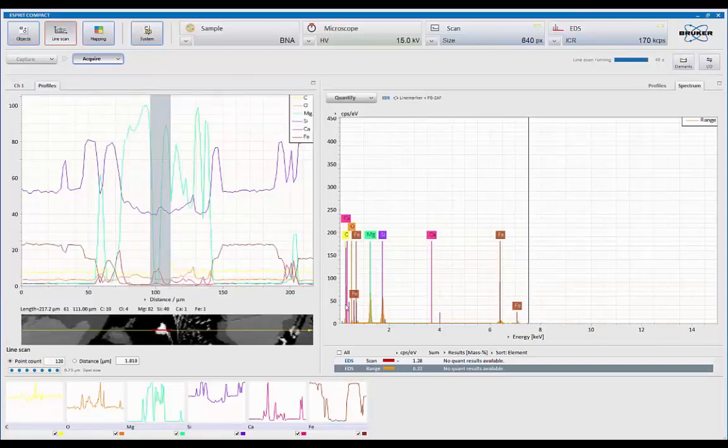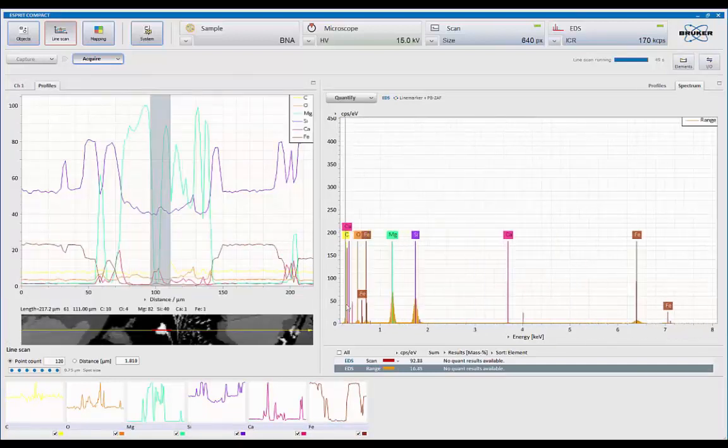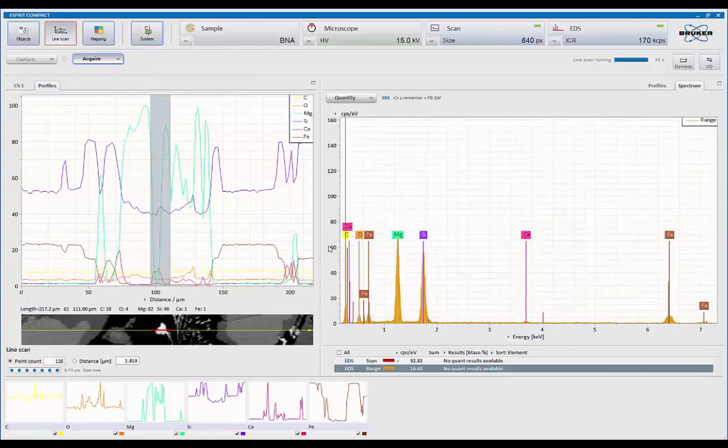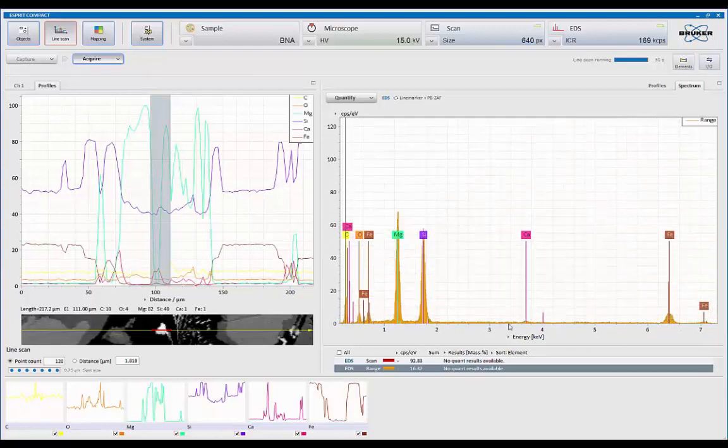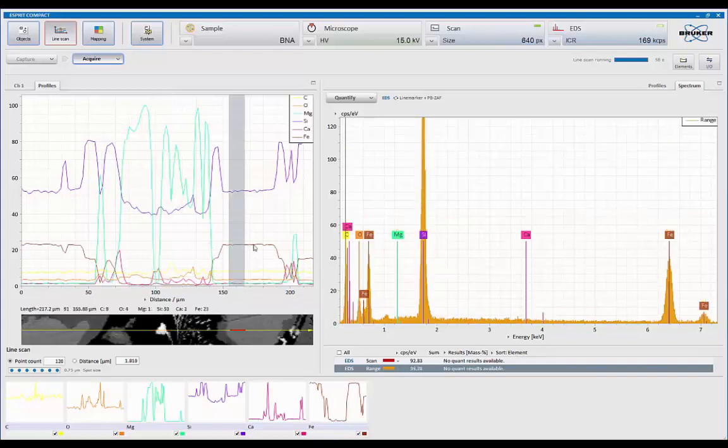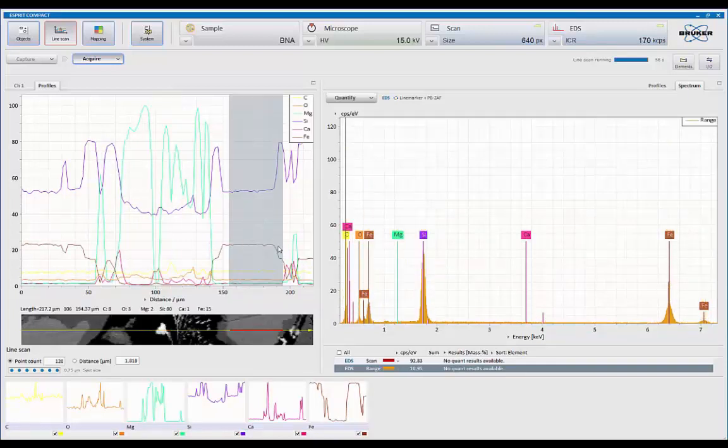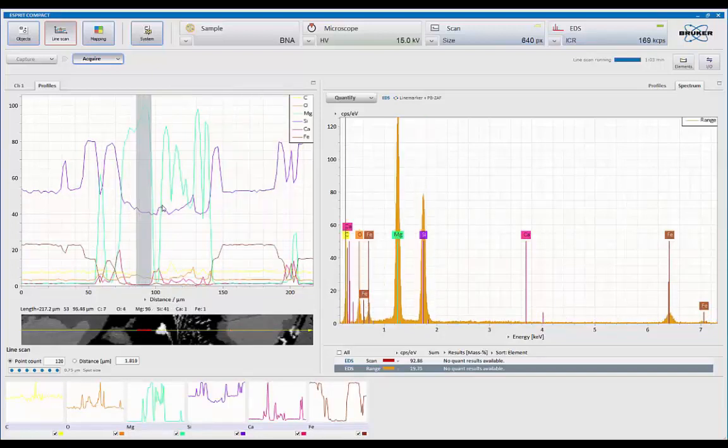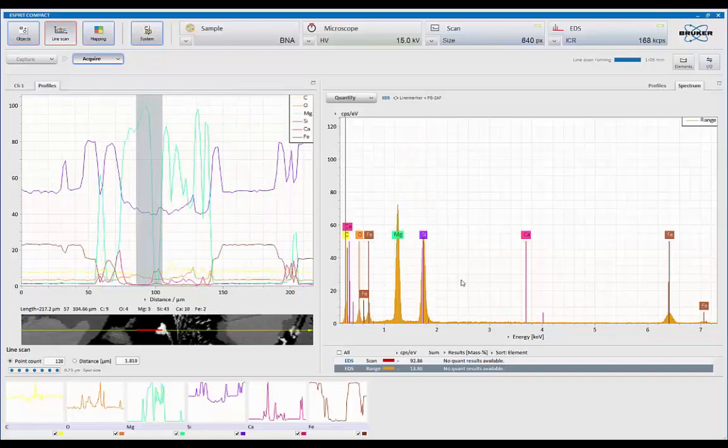So if I want to see what the difference is from one region to another. So in this area here, we see it's magnesium, silicon, and iron. Let's look at it over here. So I can integrate an area. And here we see it's just silicon and iron. Over here, it's mag and silicon.